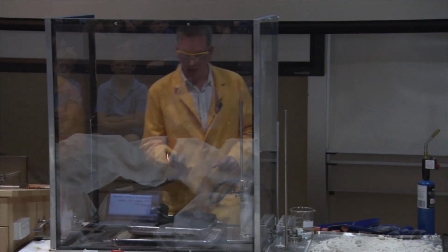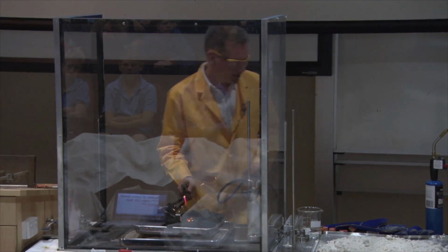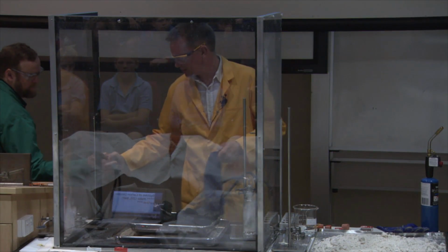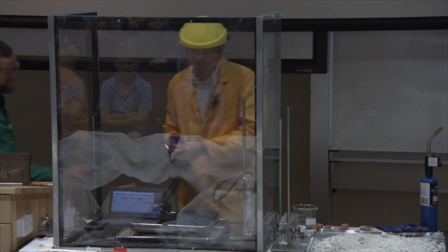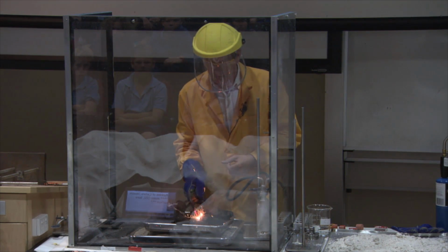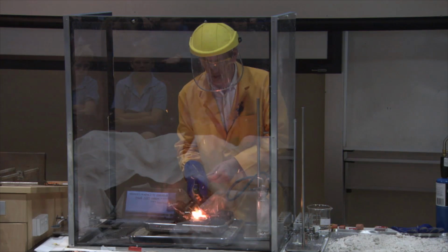I'm just going to heat up the carbon first of all. So this is a nice way to get my barbecue started. Actually, is there a shield, please? I'll just put that on. I'll just put a glove on as well, thank you. Thank you. Lovely. Just in case there's any sparks. So I'm just heating up the charcoal first of all.